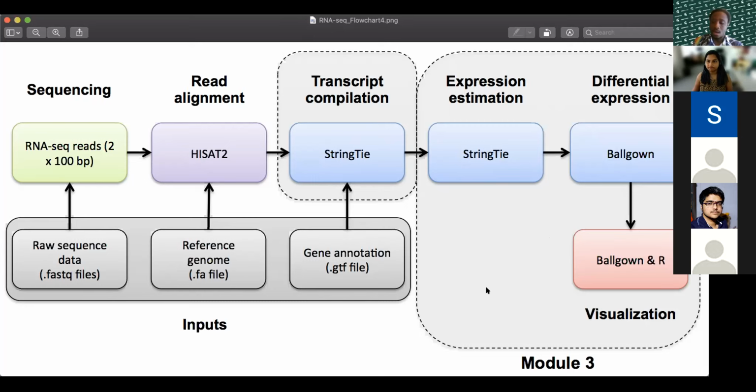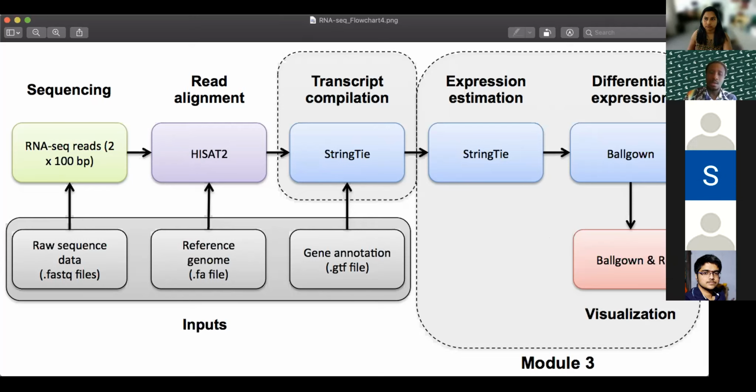So this is the workflow, and most of these steps are done using the command line, because when you are trying to go through this workflow using R, even though there are some R codes and some R libraries that are being used, normally there are some online or available tools like HiSat and Bowtie, and others that are being used in getting this RNA-seq workflow done.